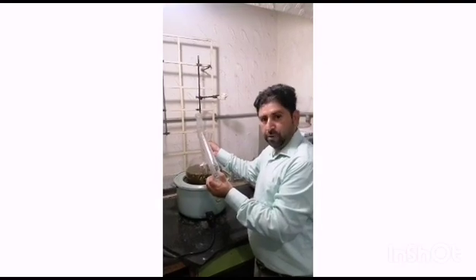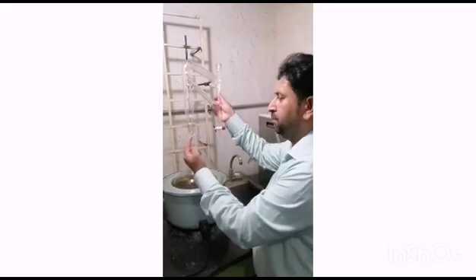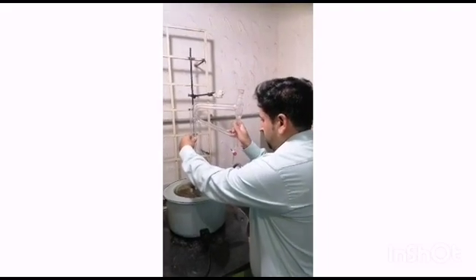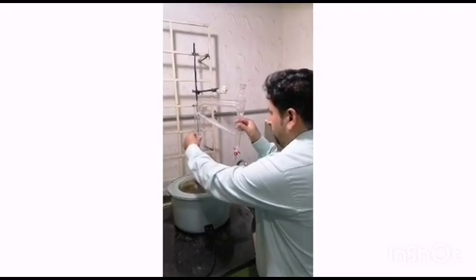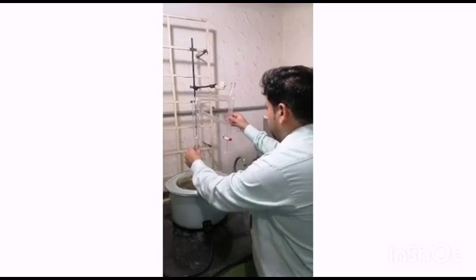First we will put the round-bottom flask — here we have 250 grams of plant leaves and 3 liters of water. We have put this and then we will fit the Clevenger. We have put some grease here so that it should seal properly, and you can just put it and smoothly fit it here.